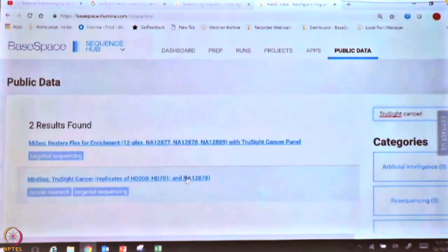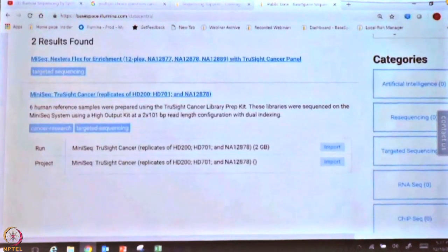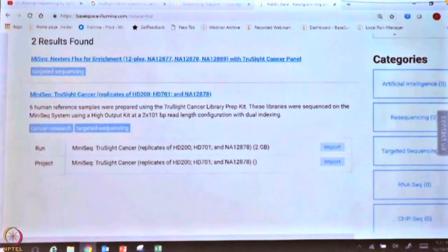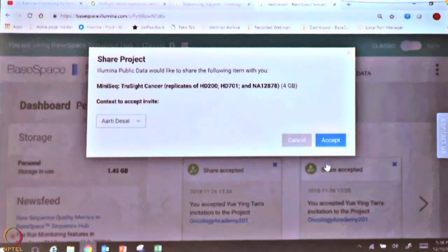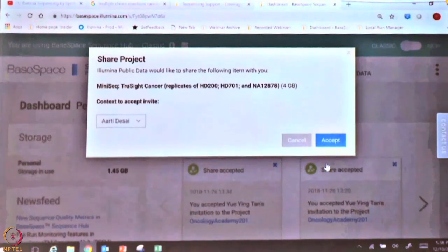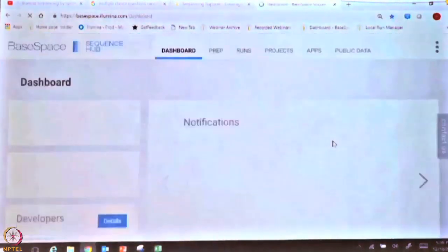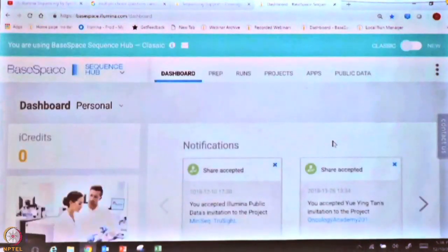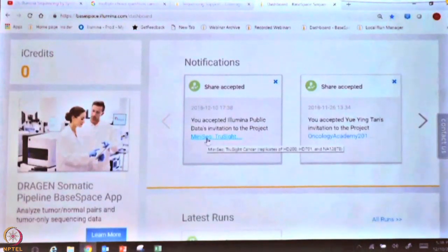When you click on that, it will expand and you will see two options: run and project. We want to import the project, so click on import. When you click on import, you will get a pop-up asking you to share the project with you — accept it. Once you accept it, you should see it in your notifications that you now have this project, MiniSeq TruSight Cancer.